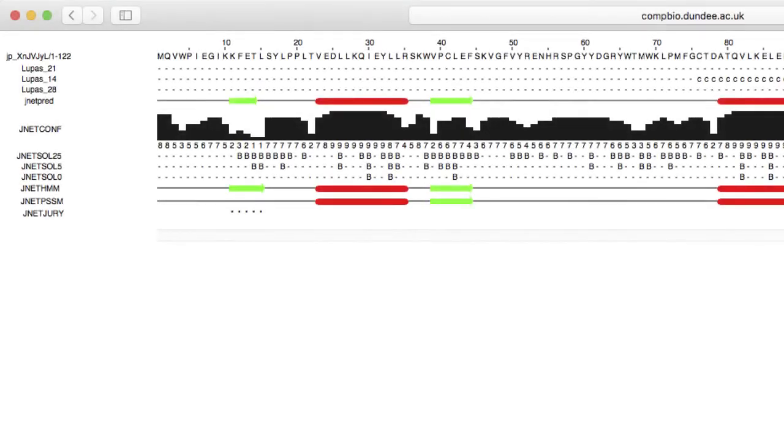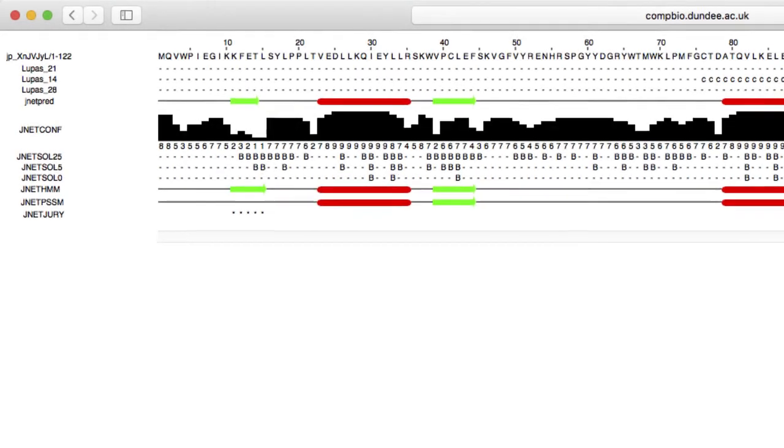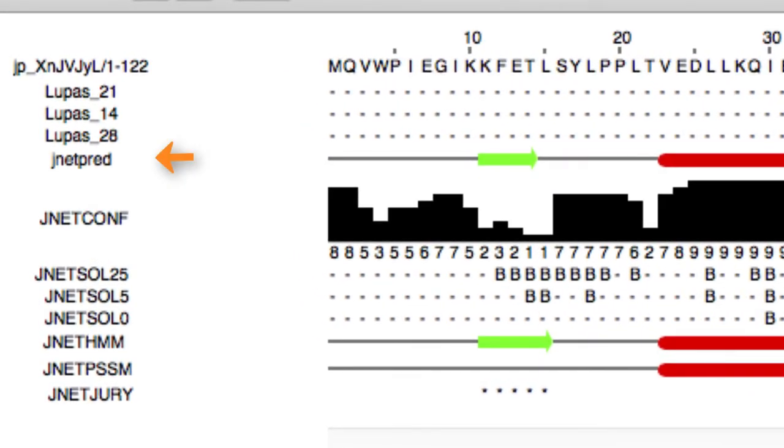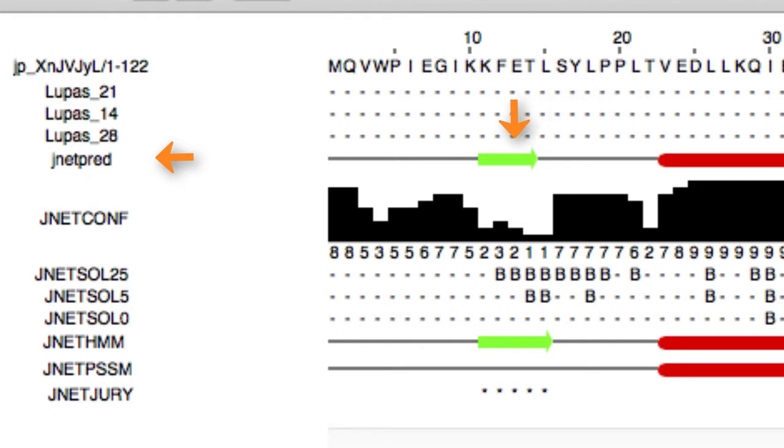Let's look at the results in more detail. The JNET PRED row shows the JPRED secondary structure prediction for the query. Helices are marked as either red tubes or with the letter H. And beta strands as green arrows or as shown by the letter E.